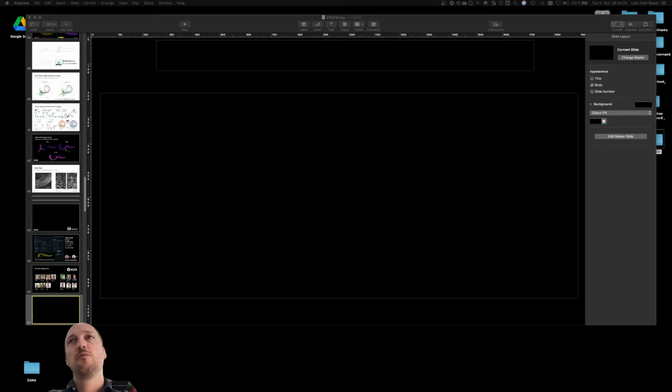I don't think it's anything very special for the cover. So the question is, what kind of cover slip do you use on the sample? Actually, we avoid putting cover slips on top of the sample. What we typically use are little wells. I'm not sure that's the correct word, but, like you saw, the little wells have a glass bottom, and the glass bottom is the typical cover slip thickness, so that you can match the optics with what the objectives are used to. The easiest is to check the paper for the actual details. I don't have the details about the particular mounting receptacle we use at the top of my head.